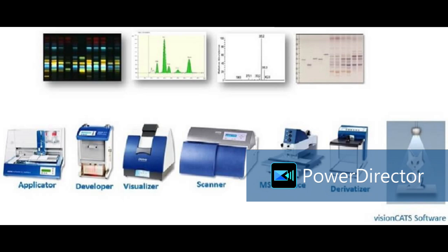So up till now we have seen what exactly the difference between TLC and HPTLC, the basic principle and different modules in HPTLC system, and in that modules application, development, detection module. Now we will start with detection modules. We have seen application and development, so that is the part of chromatography. Apply, run in mobile phase, separate the components. But after separation, how component looks, how they are absorbing light, what are the properties of that component, what are different properties, that we are finding out with detectors.